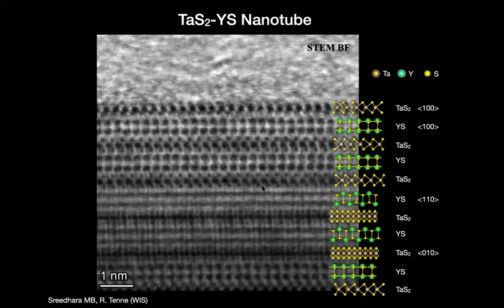It's a problem. Basically, the best thing to do would be to heat inside the microscope before you observe. That means you heat up the sample to something like 600, 700 degrees and release the carbon. We didn't do this here, but it's a very good point. It's always an issue, and this is one of the nasty practical issues.